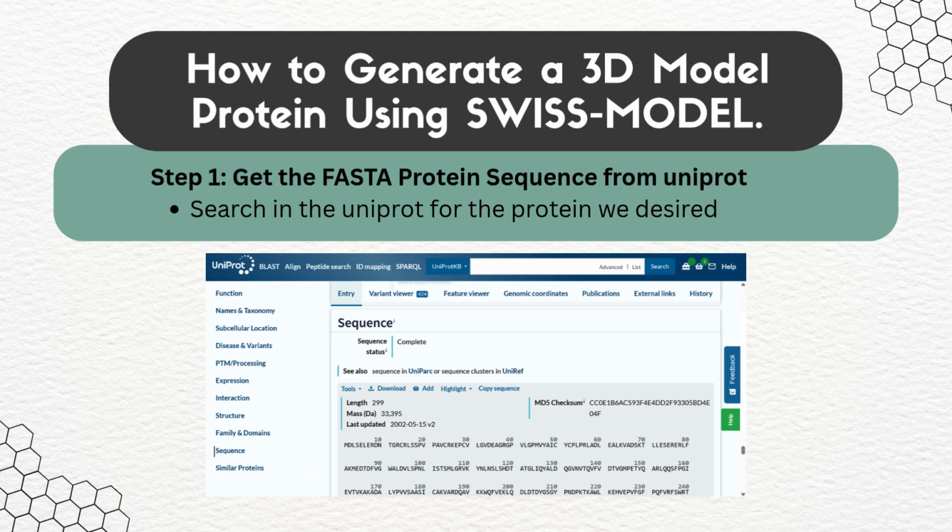Firstly, get the FASTA protein sequence from UniProt. Search in UniProt for the protein we desire, scroll down to the sequence section and click FASTA to copy the full amino acid sequence.